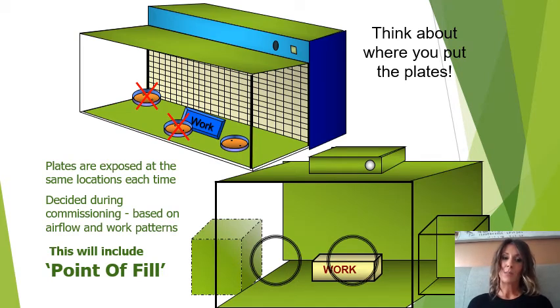So the plates need to be exposed at the same locations each time. I mentioned that before. That's decided during commissioning. So you need to validate this, as I mentioned, based on your airflow and your work patterns. So this will include your point of fill.